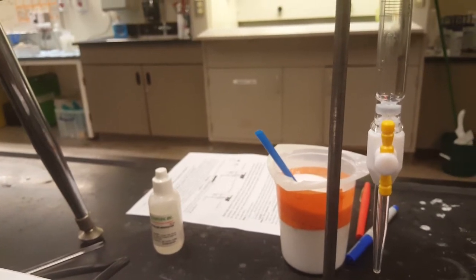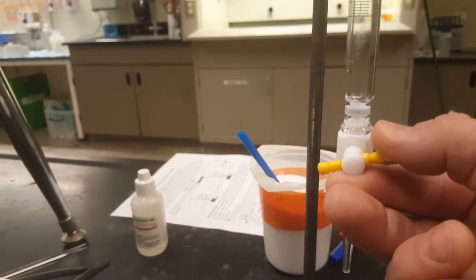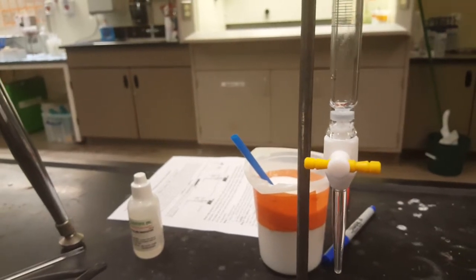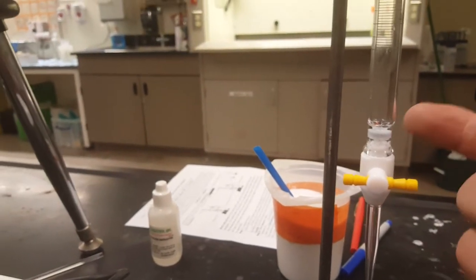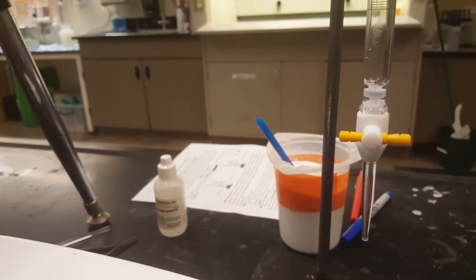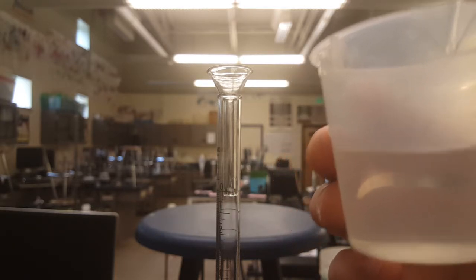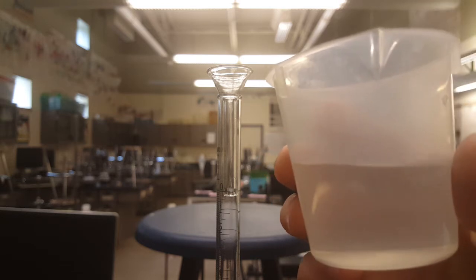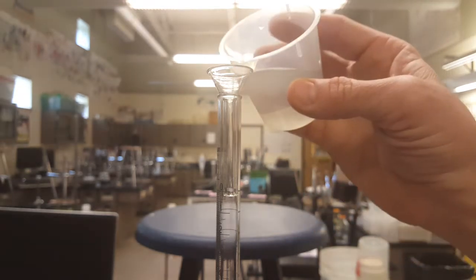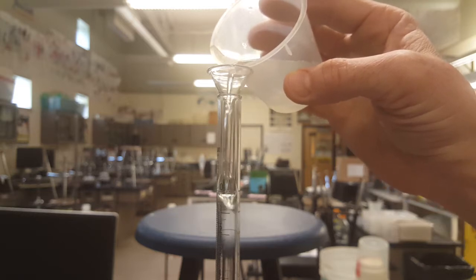Before you add anything to a burette, make sure that this valve is perpendicular to the burette. Close it. You may have been booby-trapped. If you've been booby-trapped, then when you load your burette, it'll drain out of the bottom. For this lab, we're adding base to the burette. There's your mnemonic device to remember what goes in the burette. It's your base. So here's my sodium hydroxide, and pour it into the funnel. Make sure your stopcock is closed.